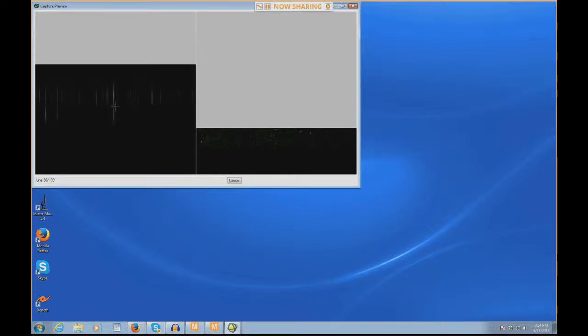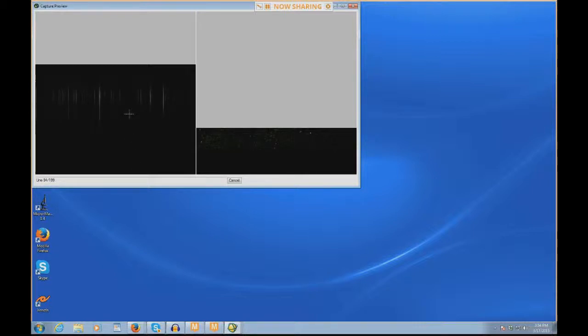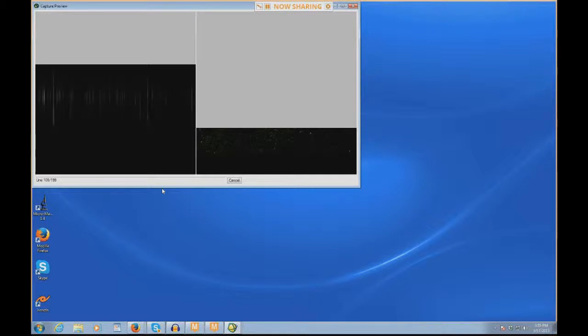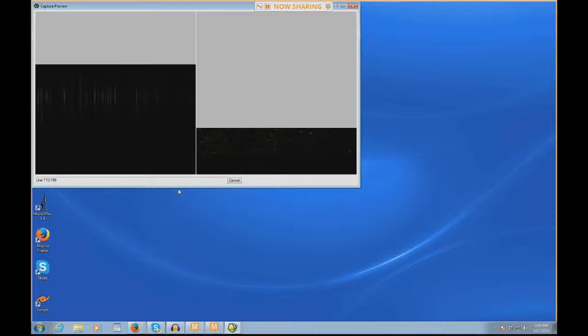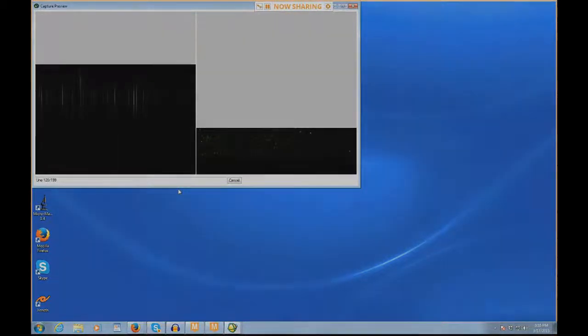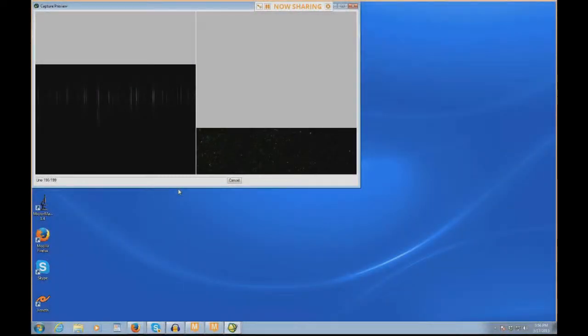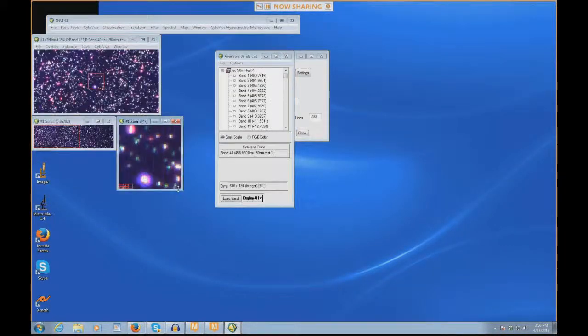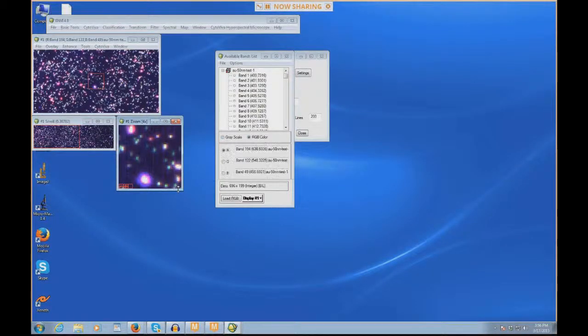One thing you might notice here is that the spectrum on the preview window at the bottom started at 400 nanometers and went up to 1,000 nanometers. This window is actually flipped. 400 nanometers is at the top, 1,000 nanometers is at the bottom. I'm going to sort of jump ahead to where this scan will end. When the scan's over, we'll continue. We see the scan's winding down here, and when it gets done, it automatically opens in Envy.